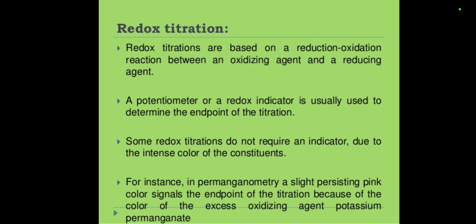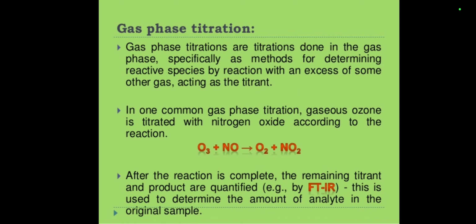And basically, if we undergo a certain type of titration like redox titration, we have to use or require a potentiometer or the redox indicator. Okay? So take note of that. So now let's proceed to the gas phase titration.